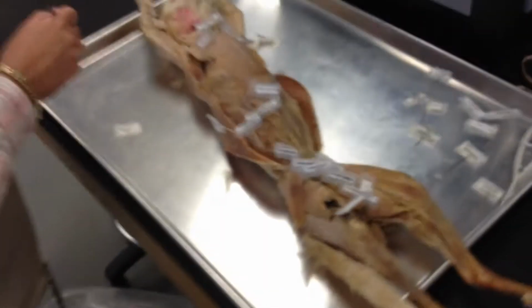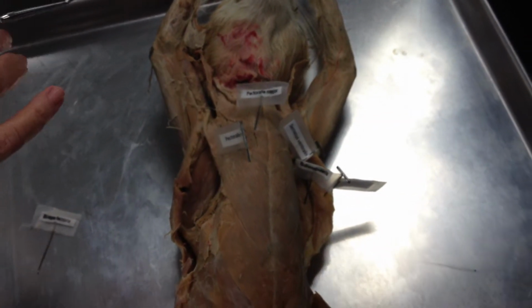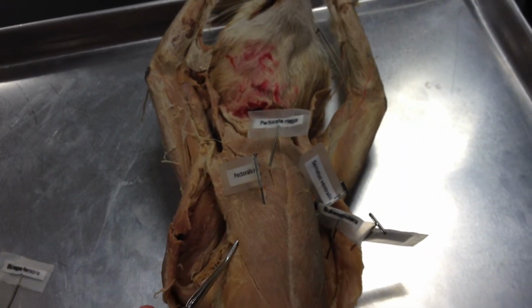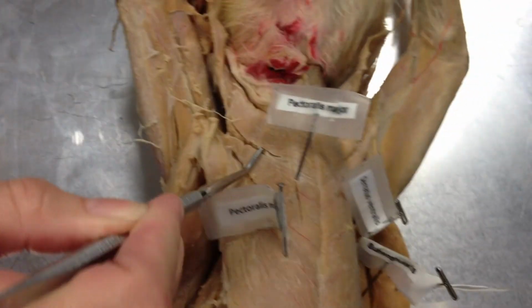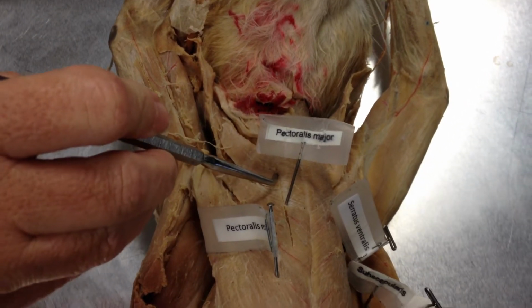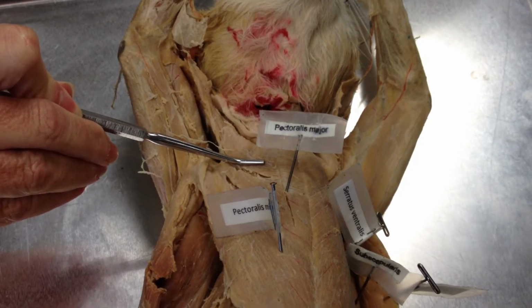All right, we're learning the anatomy of the cat. Felis, I don't know, feline, whatever. All right, Mrs. Harvey. Anterior side. This is pectoralis minor, and this is pectoralis major. This muscle up here is cat only. It's called pecto antebrachialis. It comes out onto the arm. It's the one that we don't need.